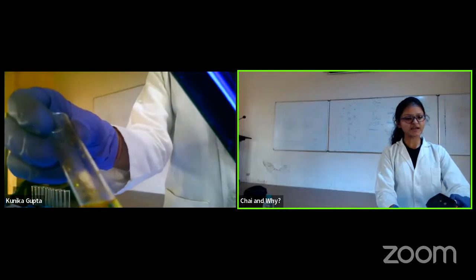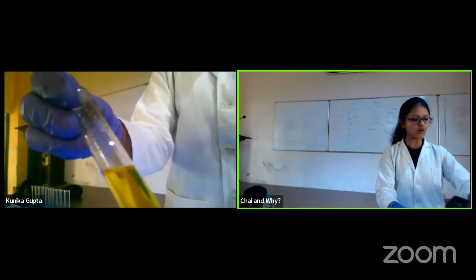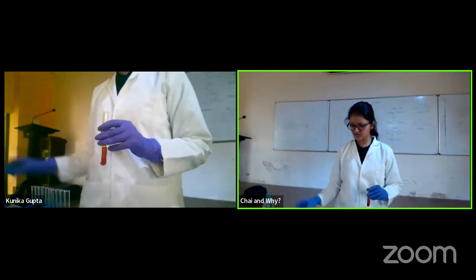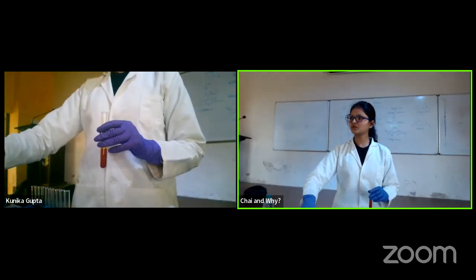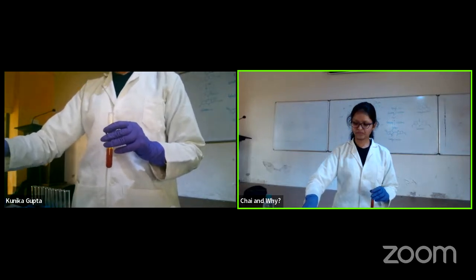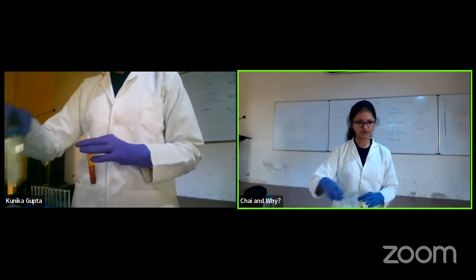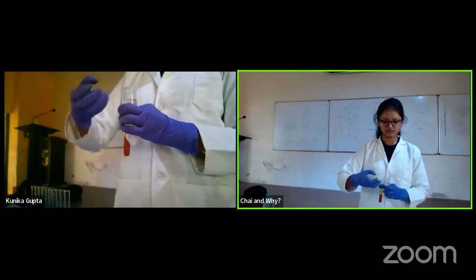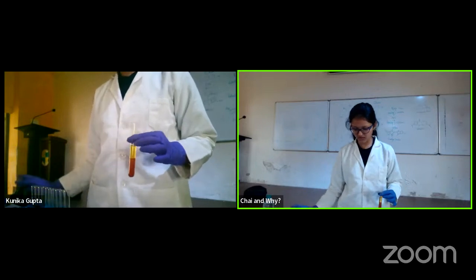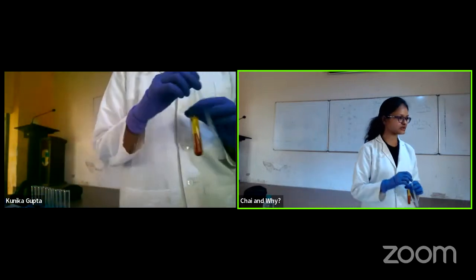So you do not see anything still in the UV. Now what I will do is I add a base. Do you know what a base is? Anyone? What is a base? Somebody said it's an alkali. Okay, that's great. Some more answers? Do we have anything?